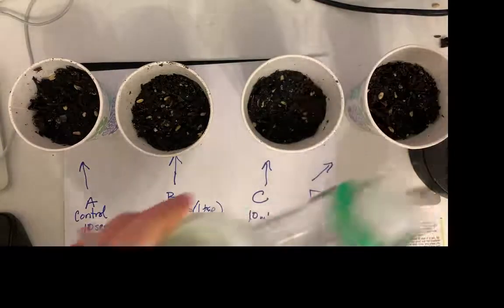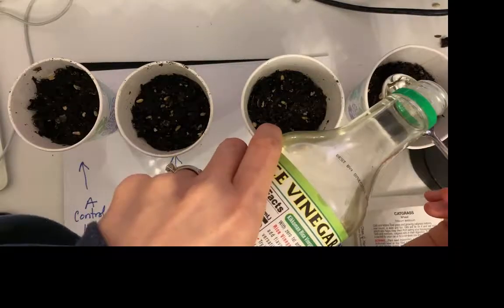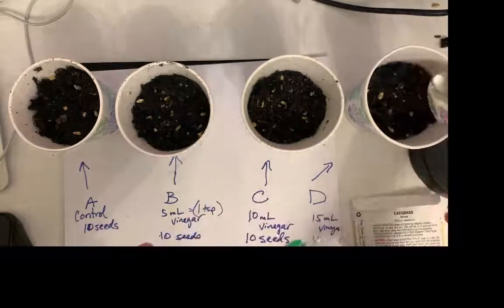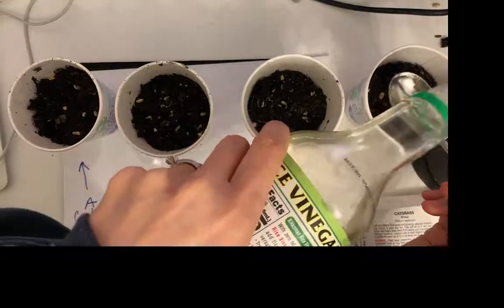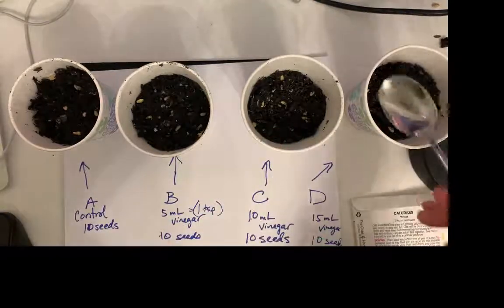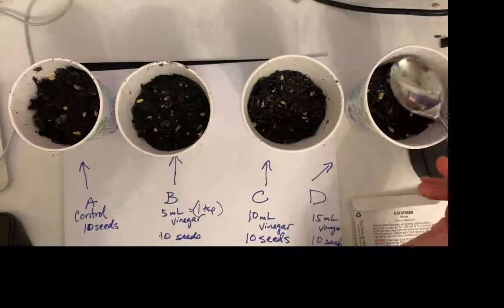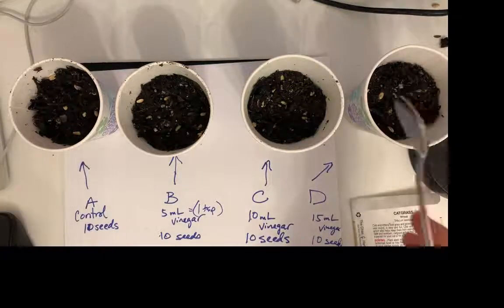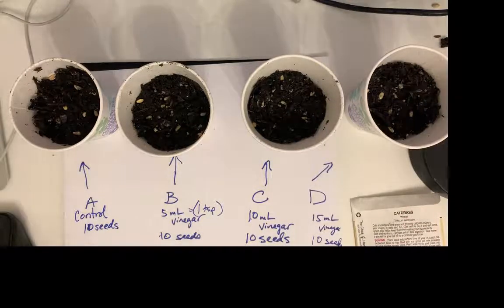And then this one's going to get 15. I've already added the same amount of water to all of them, and, oh, kind of stinky.